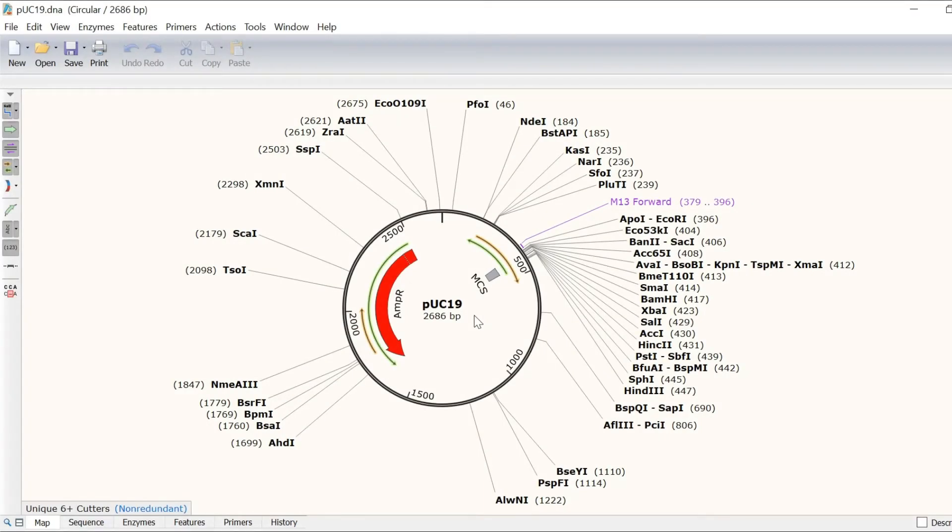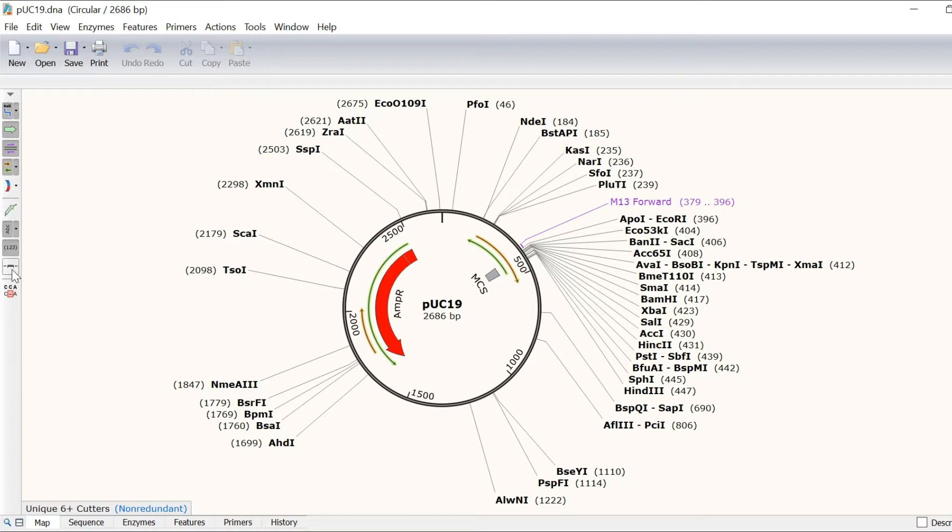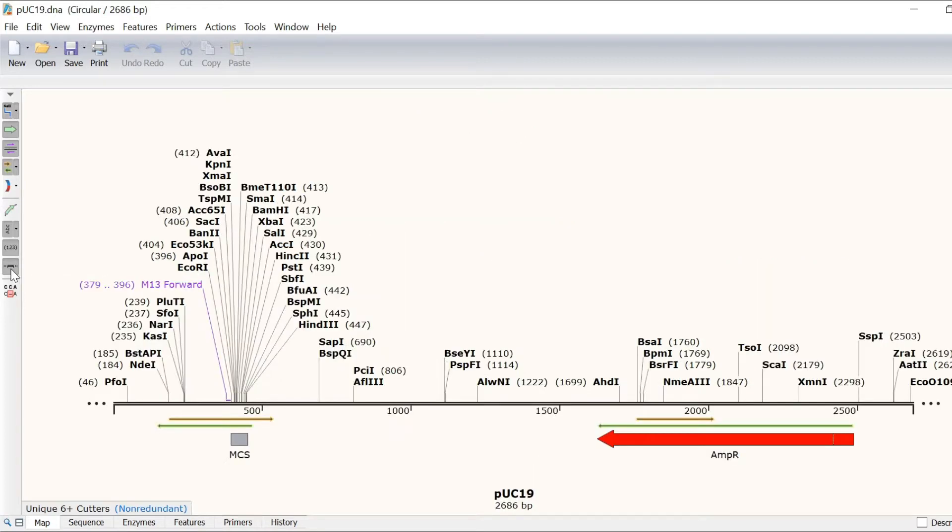I have a DNA file open here containing the PUC19 plasmid sequence. Because this DNA sequence is circular, I can change the view from circular to linear format for ease of viewing by selecting the Show Horizontal Map button.